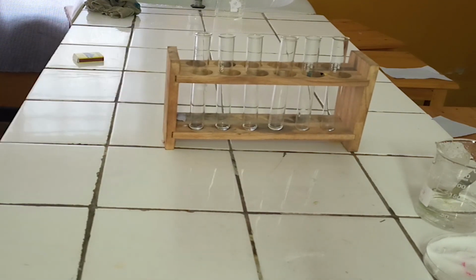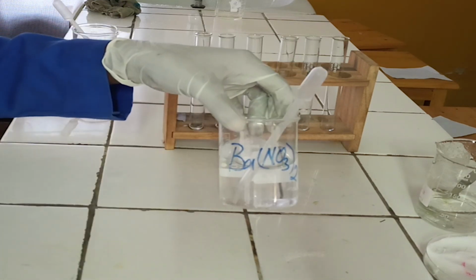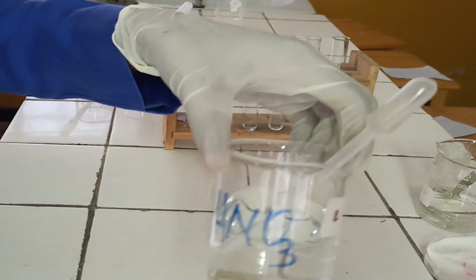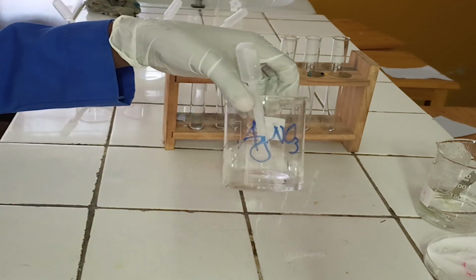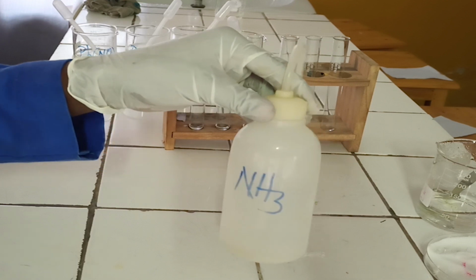Chemicals required. 1. Lead nitrate solution. 2. Barium nitrate solution. 3. Diluted nitric acid. 4. Silver nitrate solution. 5. Ammonia solution.